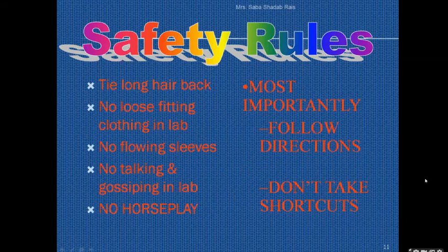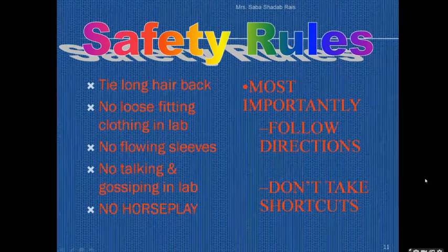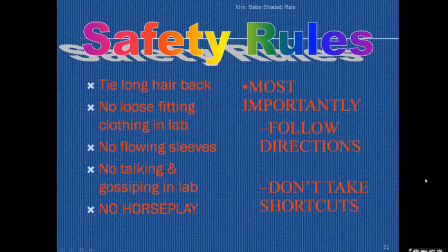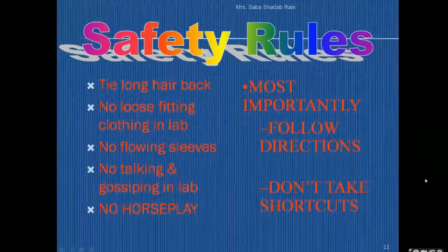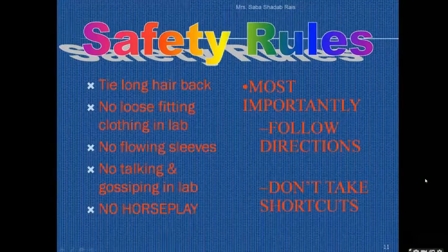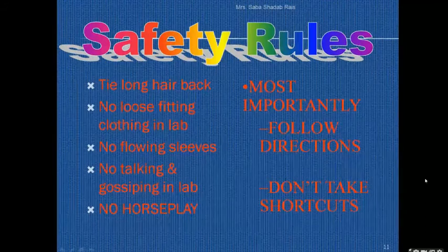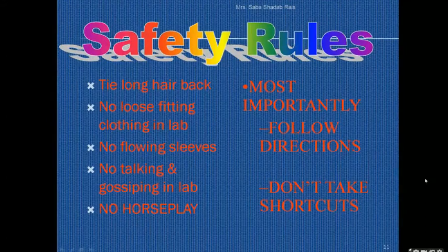Now see, some rules are for you. The first thing is that you compulsorily have to wear your cotton apron. It is very compulsory to wear a cotton apron. Proper footwear you have to wear. It is not like you are running into the laboratory in high heels. I don't have any objection to high heels or anything, but if you slip, you will harm my 10 students.